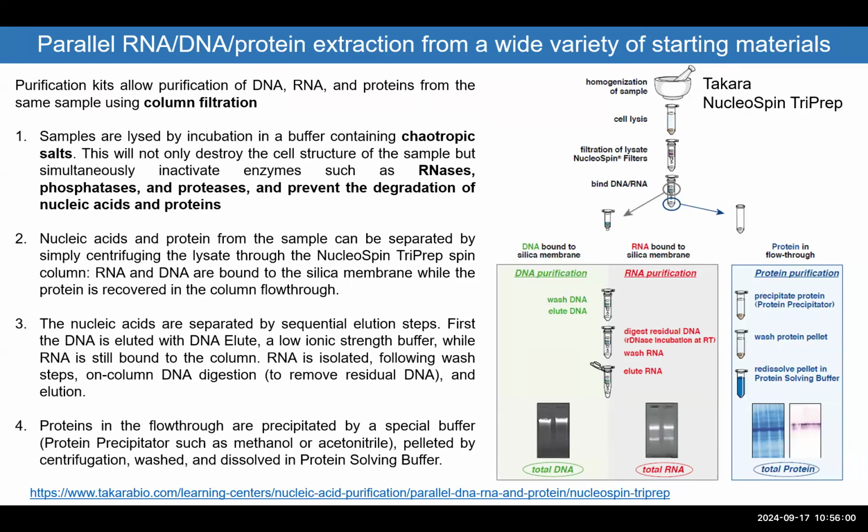But the way it works is that it has to have, in the lysis buffer, an inactivation for RNases, phosphatases, proteases, and DNases. So you want to block all the enzymes that kill RNA, kill protein phosphorylation, or kill protein itself, or kill DNA. So you want to preserve RNA, DNA, and proteins. So that's why you have a mixture of blockers for RNases, phosphatases, proteases, and DNases. That mixture will save RNA, protein, and DNA.